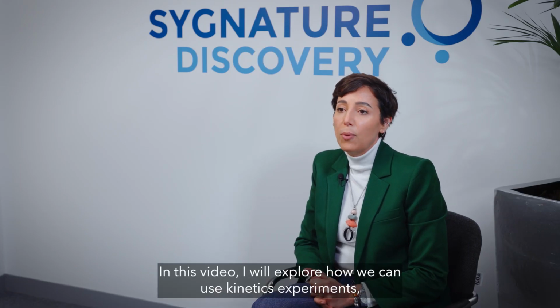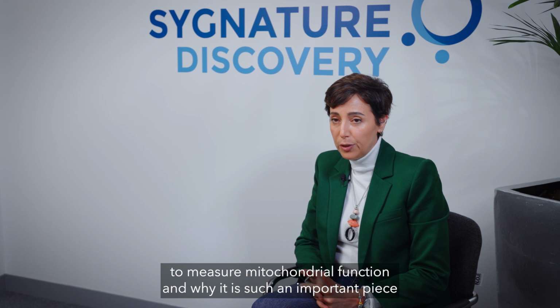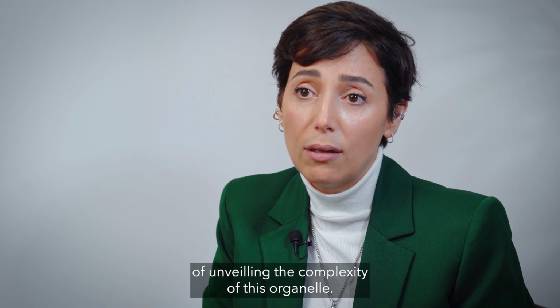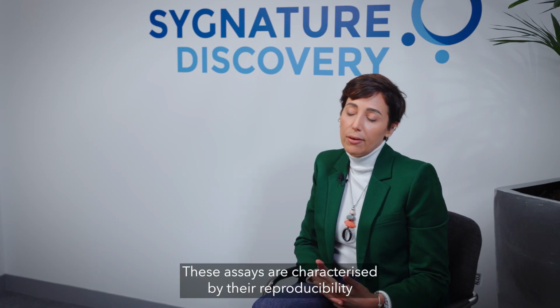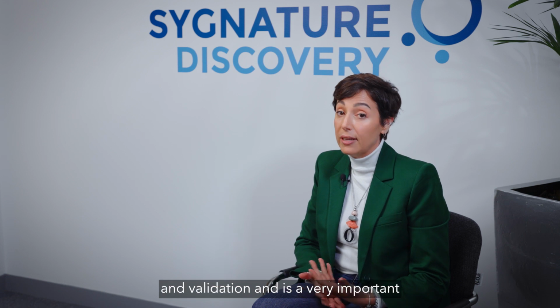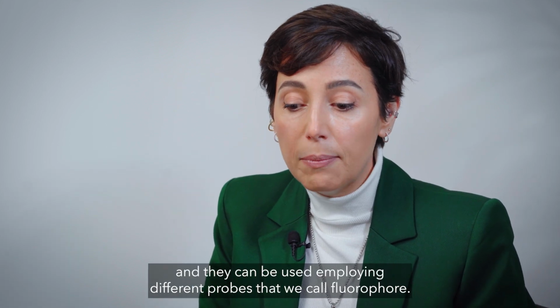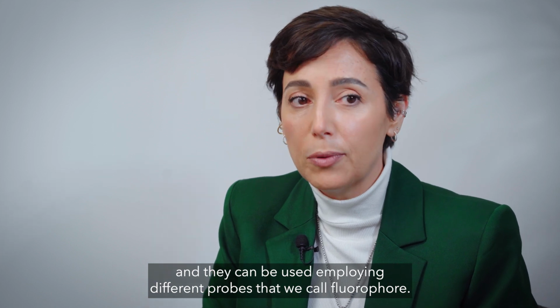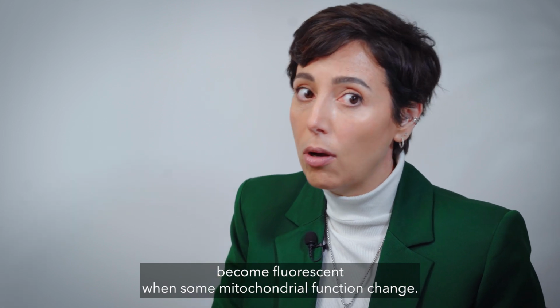In this video, I will explore how we can use kinetics experiments to measure mitochondrial function and why this is such an important piece of unraveling the complexity of this organelle. These assays are characterized by their reproducibility and validation, and are a very important part in assessing mitochondrial function related to dynamic parameters. Kinetics experiments can be used employing different probes that we call fluorophores. Basically, these molecules become fluorescent when some mitochondrial function changes.